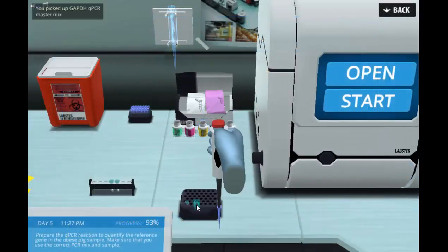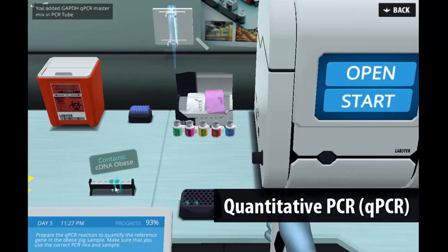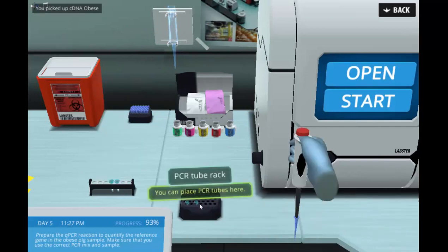After identifying a candidate gene involved in obesity, a quantitative PCR or qPCR experiment needs to be performed to validate the results.